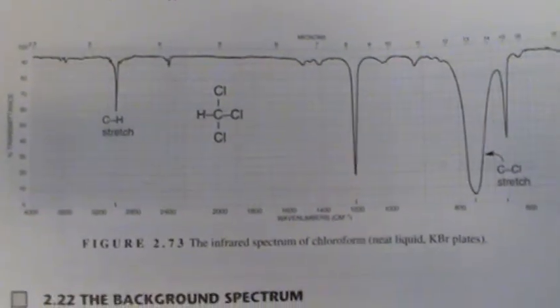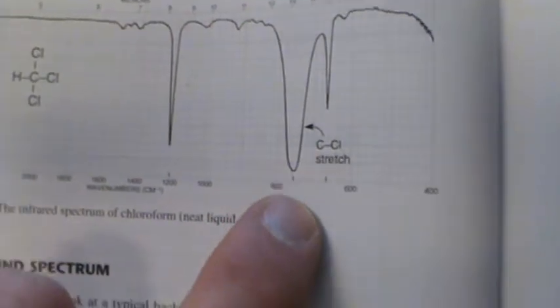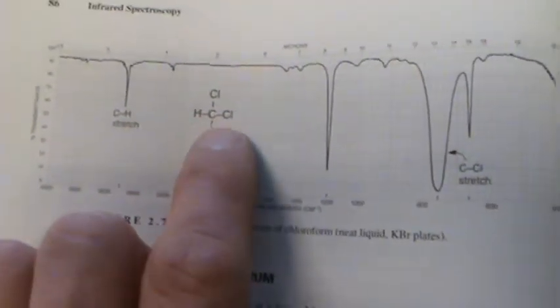This one has 3 chlorines. And yet again, you're still seeing something that's going to fool you into thinking it's in the same place, and that's what, 780. I don't have enough reference spectra. It would have been nicer if you'd seen a primary, meaning 1 chlorine on an alkane, not just this methane molecule. So let's go look at ours.